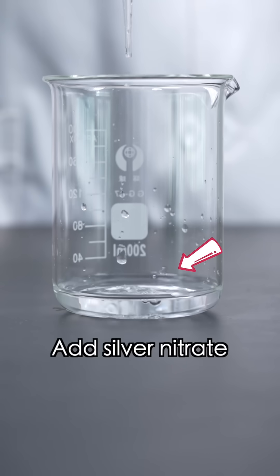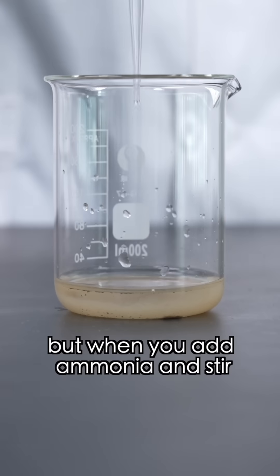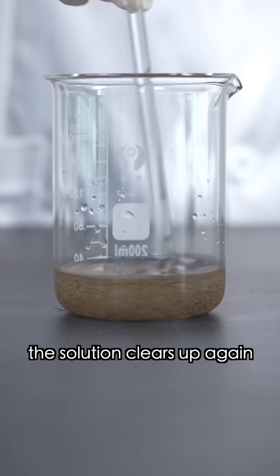The experiment begins. Add silver nitrate and sodium hydroxide solution to the beaker — it'll become cloudy. But when you add ammonia and stir, the solution clears up again.